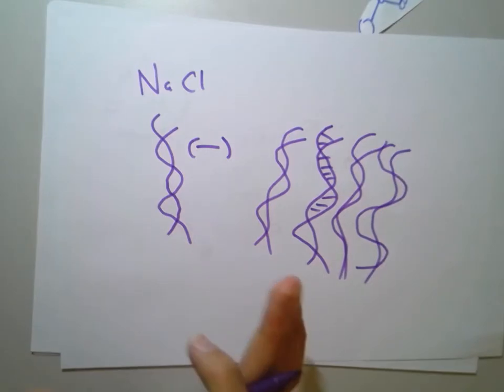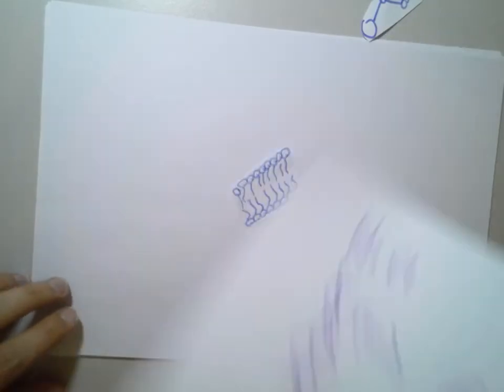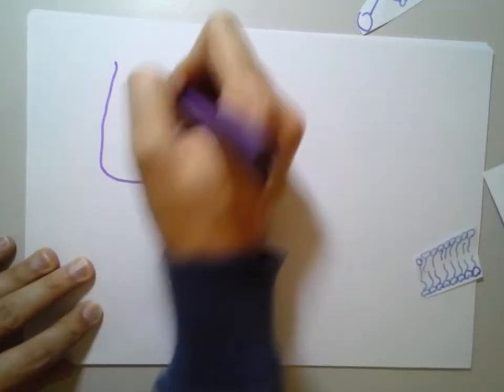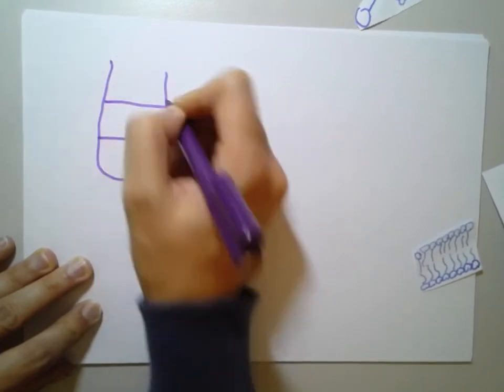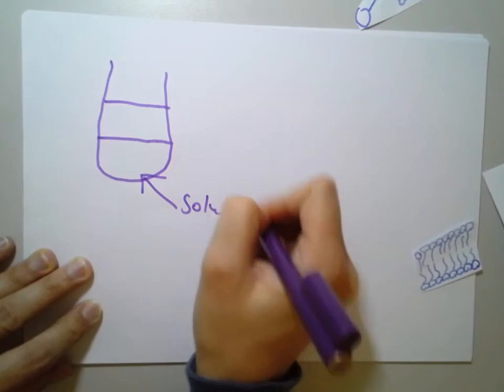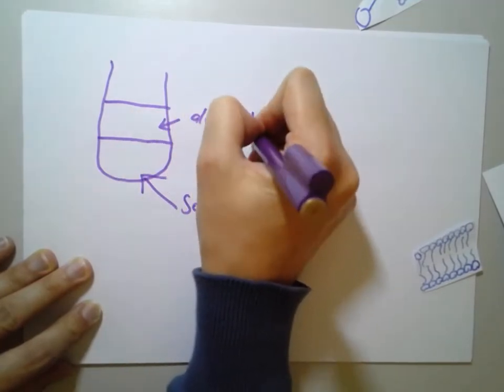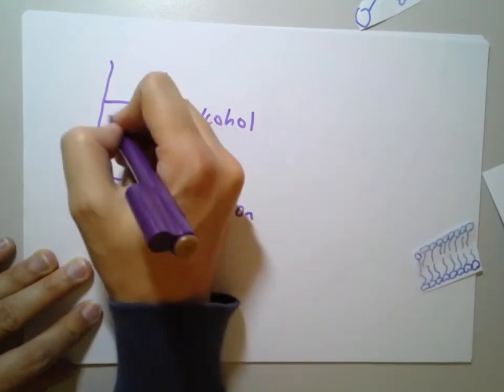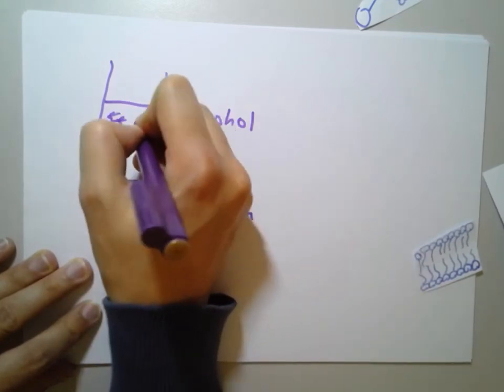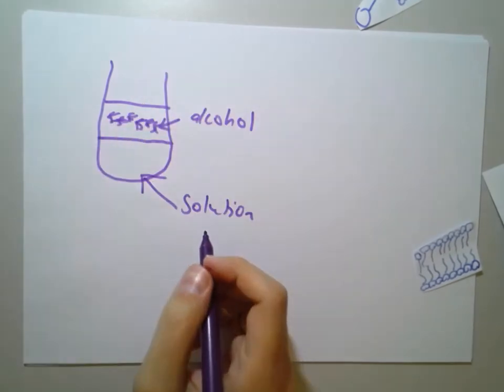And what did we use to separate them? We used the rubbing alcohol. Okay, the alcohol then. Now we had the two layers. We had the solution, and then we had the alcohol. And then our DNA. And that's just a basic explanation of what happened in today's prac.